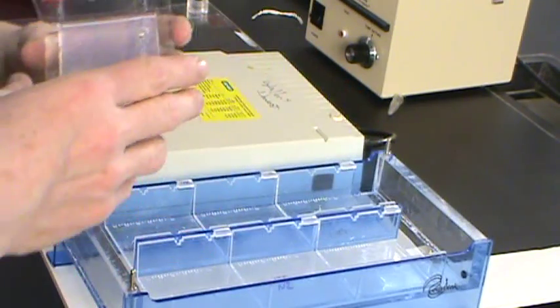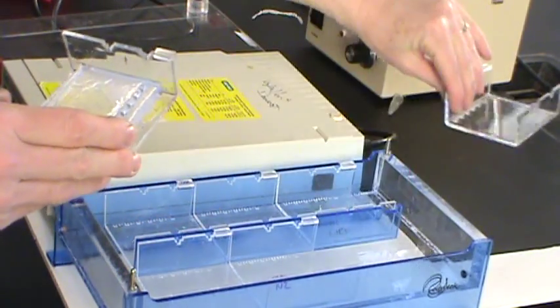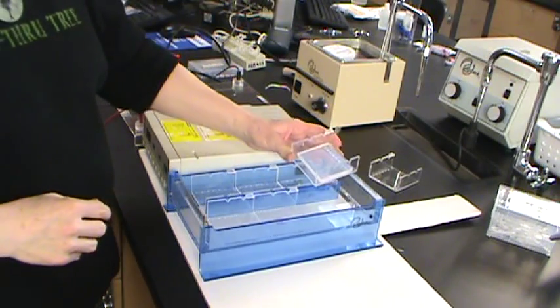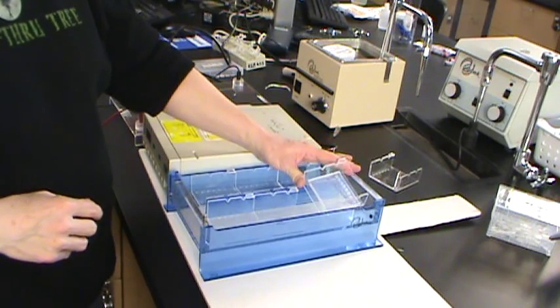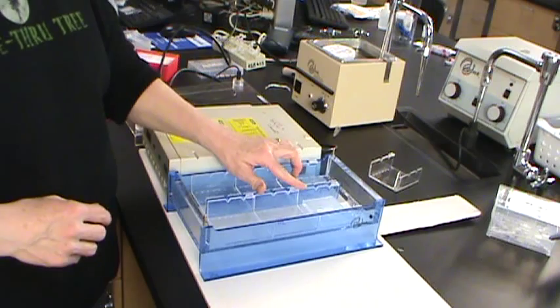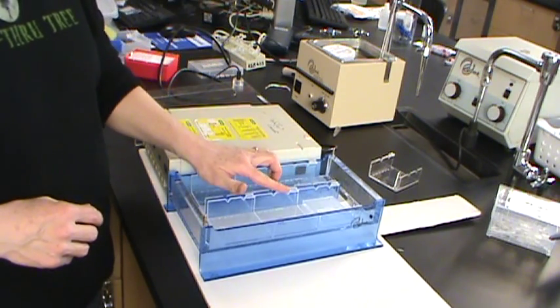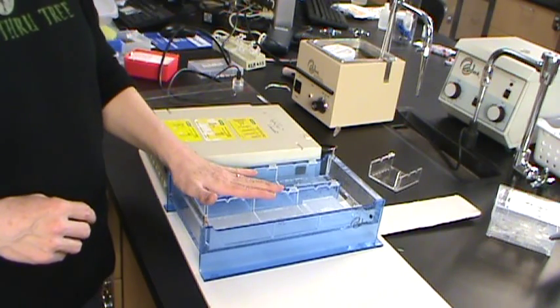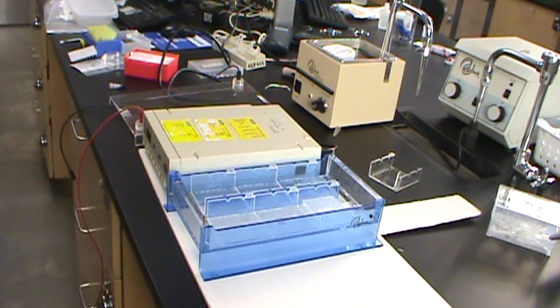Now these all go into our electrophoresis unit, and that's what we have here. This blue electrophoresis unit, and we'll have one for each classroom. You'll be able to tell that you have your gels in correctly because they have little notches where they fit. Some electrophoresis buffer will have been made for you.